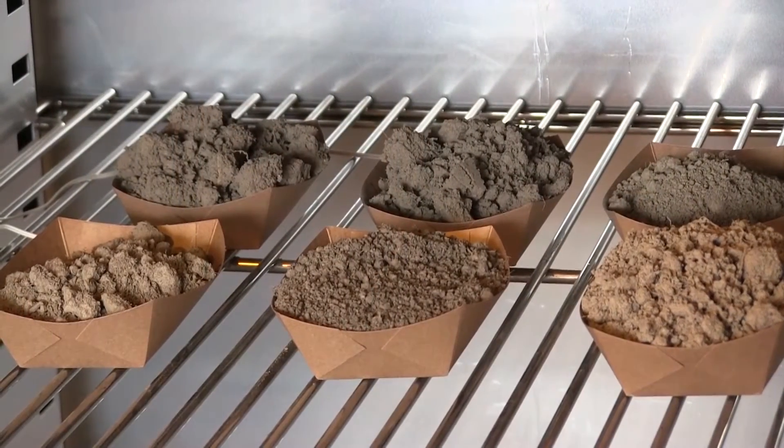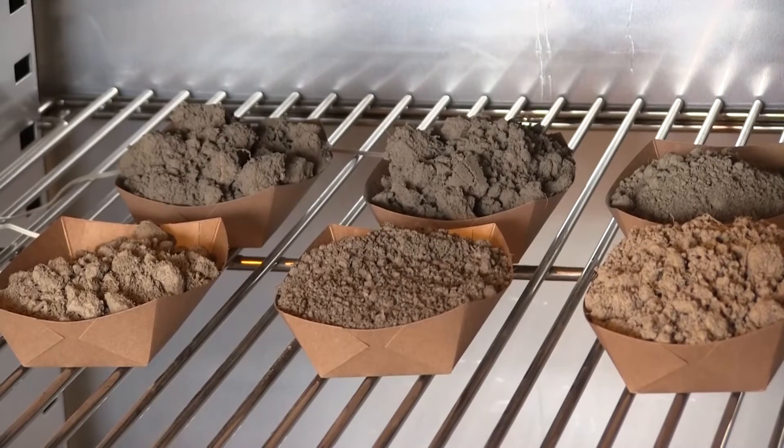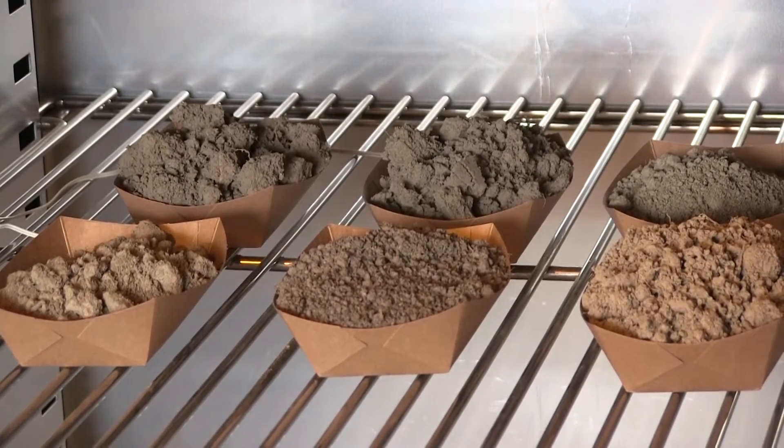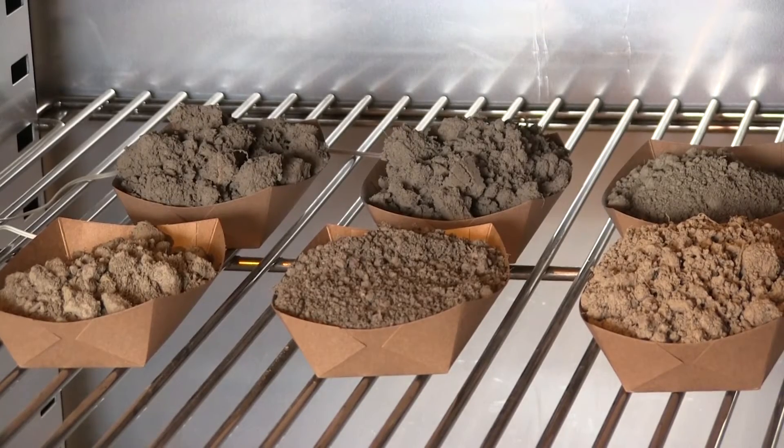Soils that come into our lab represent a wide variety of types and textures. Each of these soil samples needs to be treated carefully so as not to disrupt traits that reflect soil biology.